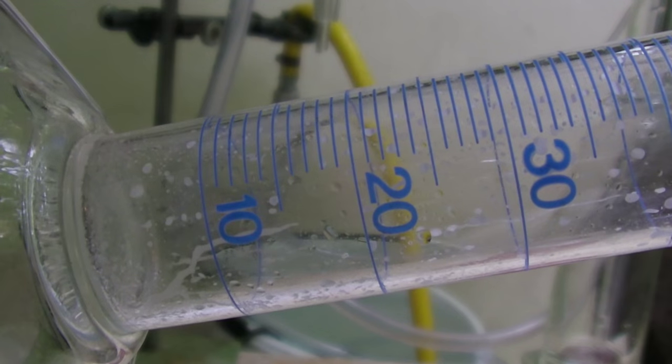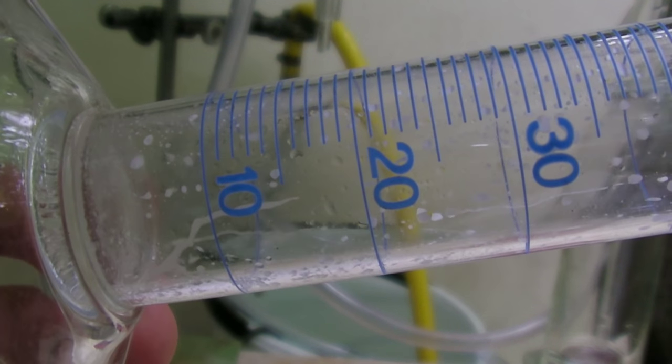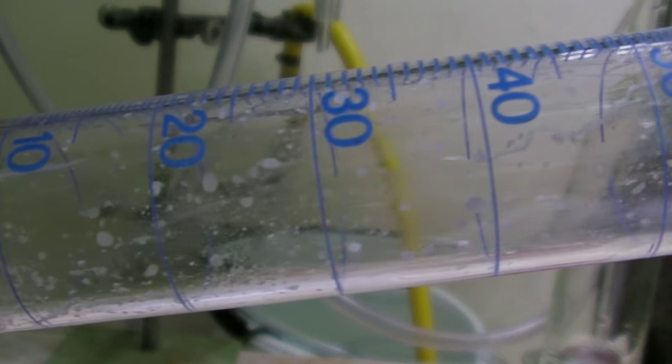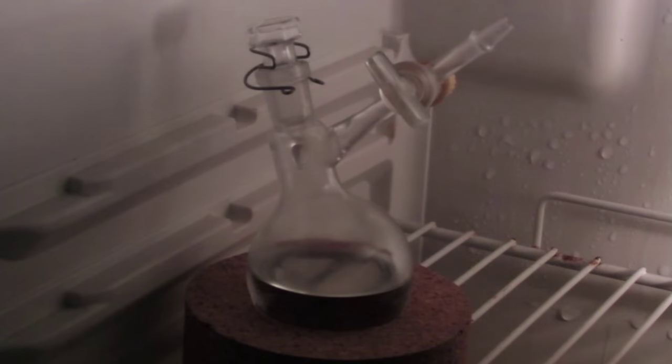After about 1 hour, the residue of the benzaldehyde in the graduated cylinder has oxidized, which shows the sensitivity to oxidation. It's best to use the benzaldehyde directly or keep it in the fridge and use it on the next day.